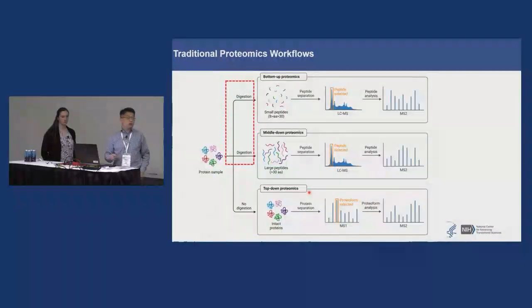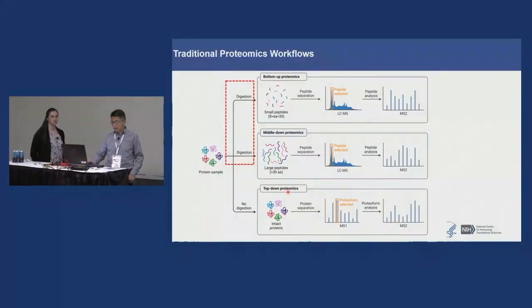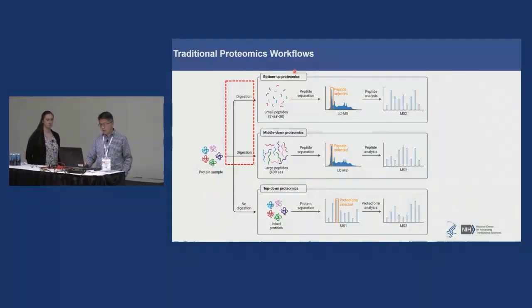So this is a traditional proteomics workflow. We have bottom-up, middle-down, and top-down proteomics. Today we are focused on bottom-up proteomics. And if you have hands-on experience, you will know that bottom-up proteomics sample preparation has a protein extraction and also a digestion step.